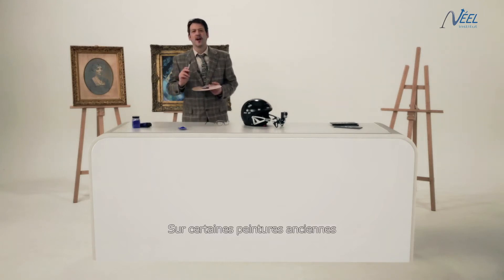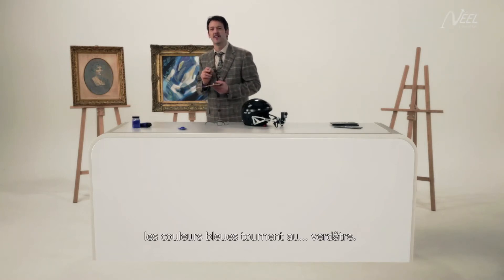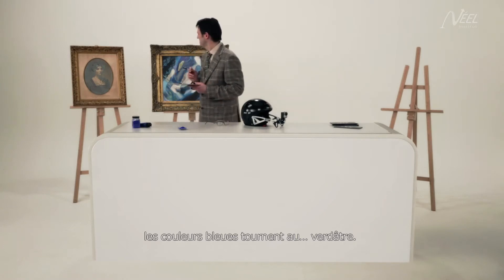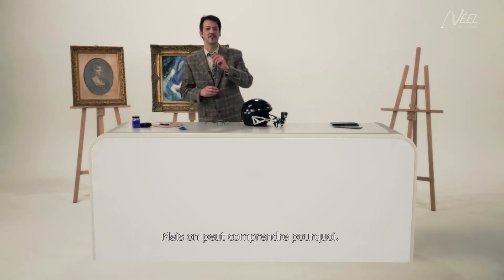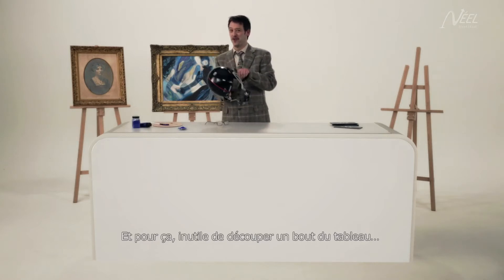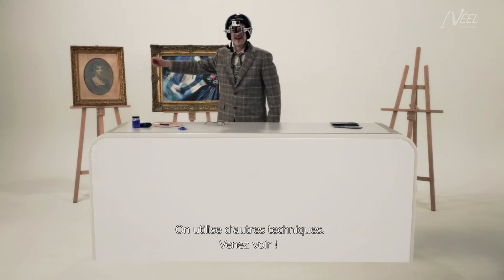Hello! You know how on certain old paintings the blue colour turns slightly green? It's not very pretty, is it? Well, this is because of the Prussian blue pigment used at the time. And to understand why, we don't have to cut off a piece of the painting — that would be ridiculous. Here we have other techniques. Come with me and I'll show you.